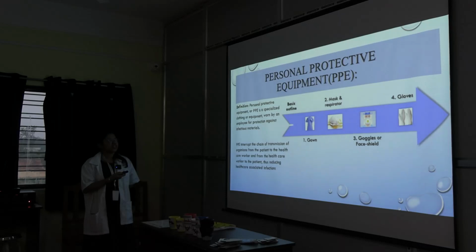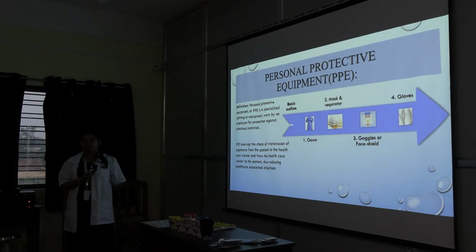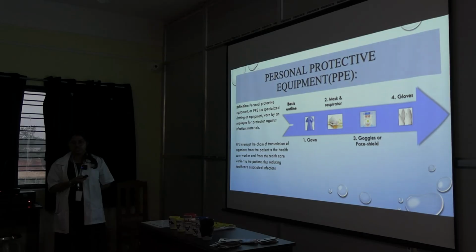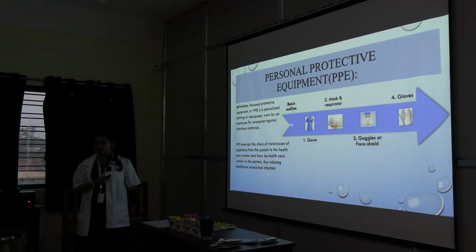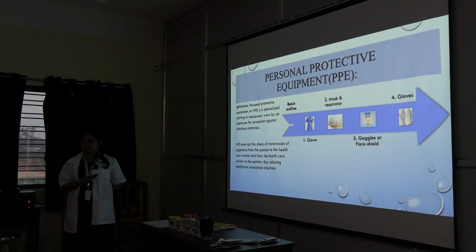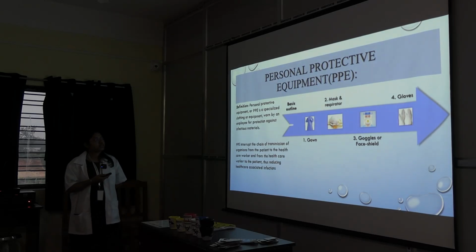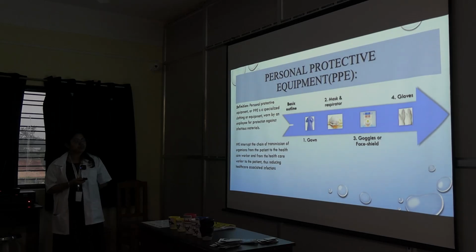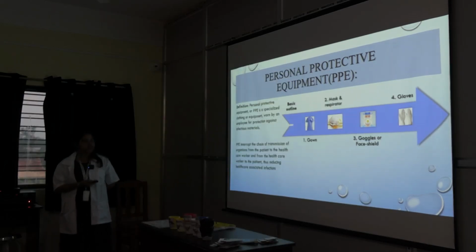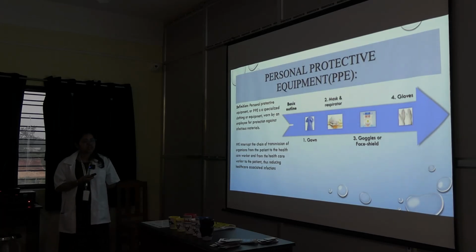Personal protective equipment, PPE. So why do we use PPE? I think you know in COVID, the healthcare workers have been using this PPE. So we use it mainly for our protection against infectious agents. What are the components of PPE? Like what does it consist of? Gown, mask, N95 mask, goggles or face shield, and gloves.